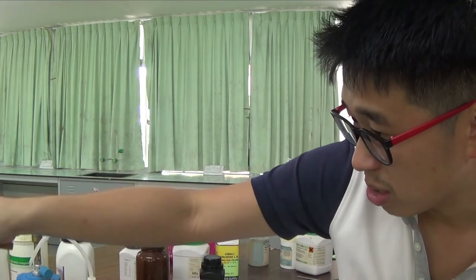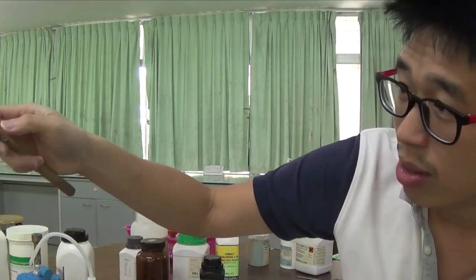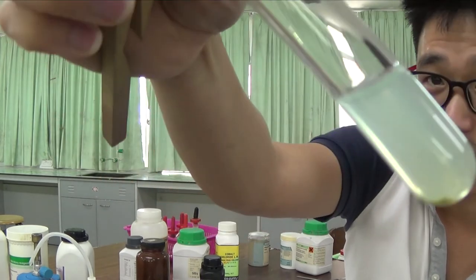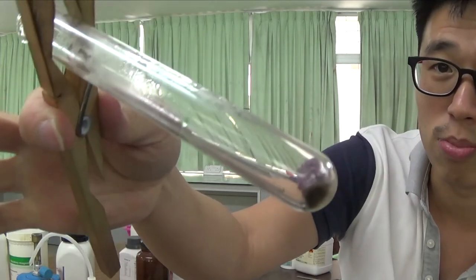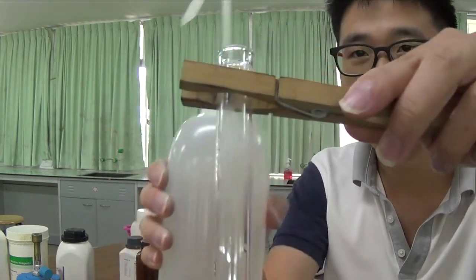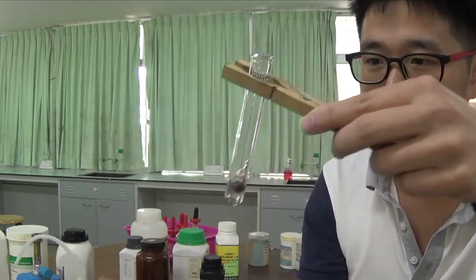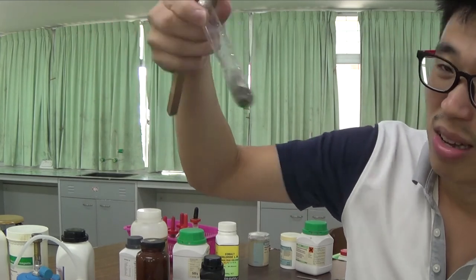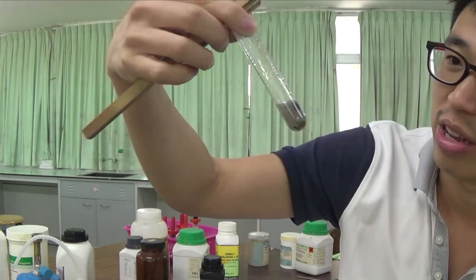Let me have a look at the other one. Oh no, sorry, the yellowy one was not the chromium. The yellowy one was the nickel 2. It does look a bit greeny now, but probably the nickel 2 doesn't want to go back. Not too sure. This is the chromium 3 chloride. This was the purple colored solid that I get after I add water to it. Does it go back to being green at all? No, it doesn't really want to go back to being green at all.